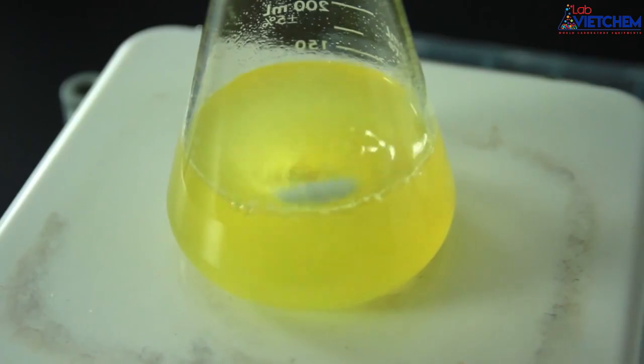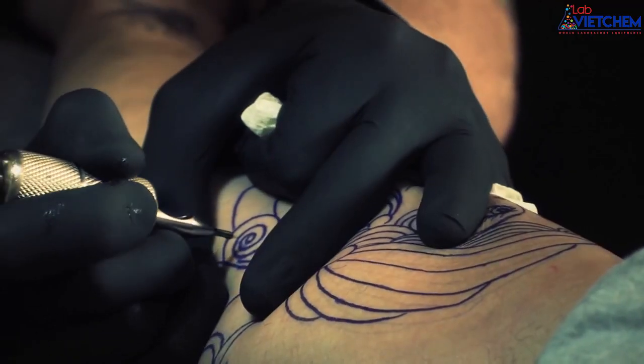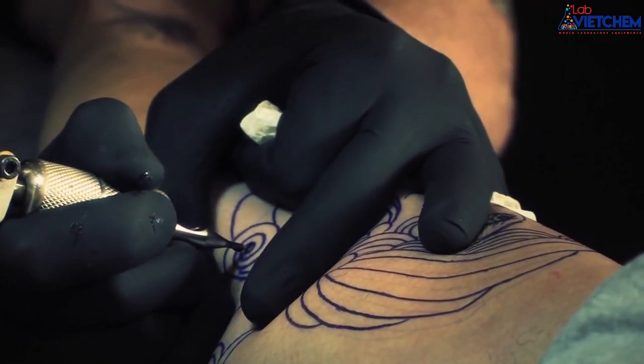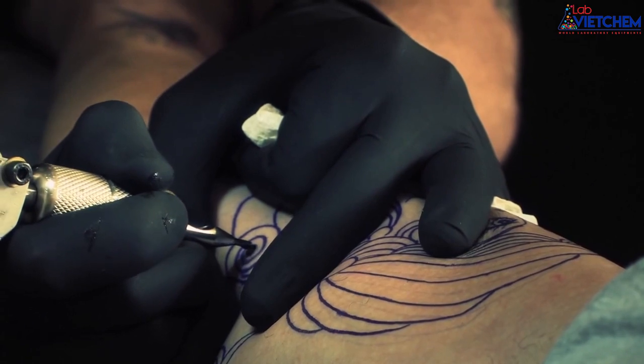Pharmaceuticals, equipment, solutions, medical waste, even tattoo needles. If bacteria, fungi, or viruses are present, the result could be deadly.